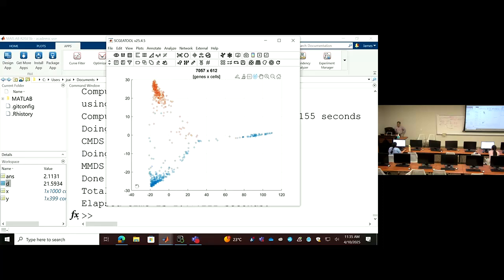I would see if we can try from this end to here. Okay, we need to clean this up because this is a branch. We need to delete those cells. We want to build one trajectory for the cells which follow this trajectory. We don't want to model this branch, so we need to delete them.